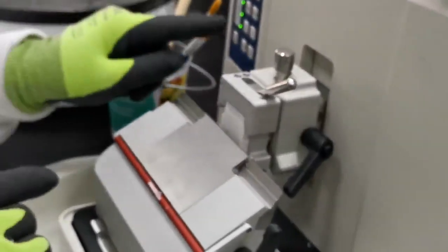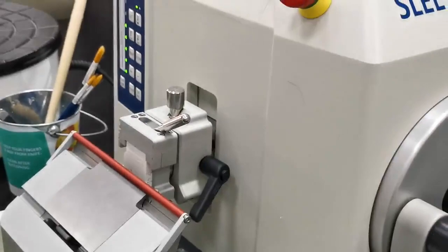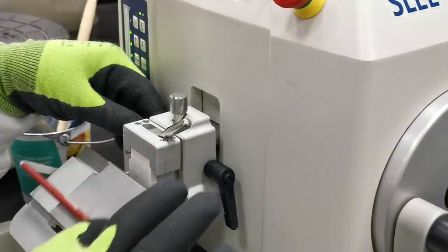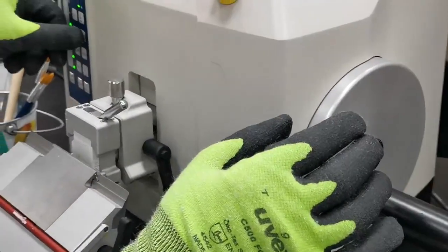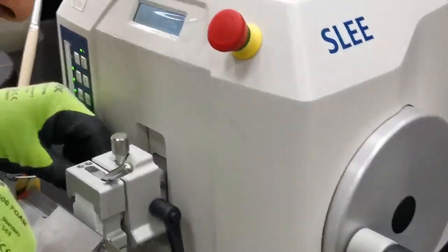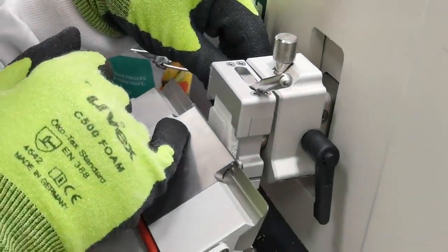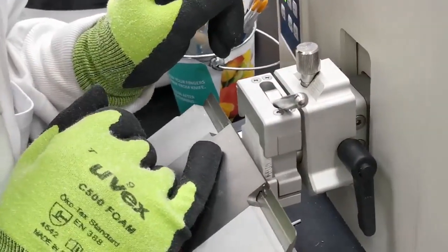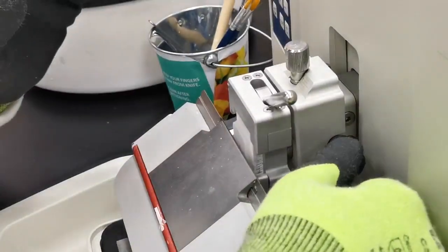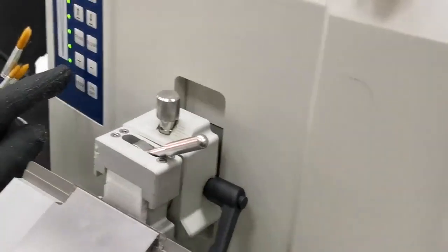For alignment, retract the block back, cover the knife, then loosen the block holder and look at the position of the block in relation to the edge of the knife. Adjust so it is aligned, then tighten again. Start with trimming mode because the block is not yet right next to the blade.